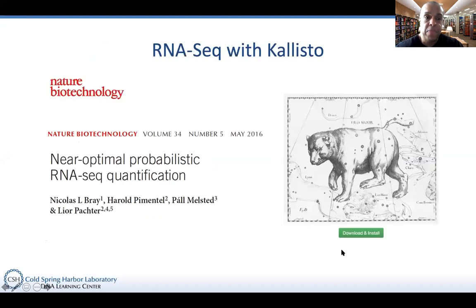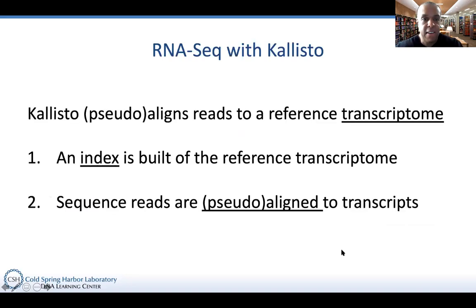software that we use. Now, in our case, what we're going to use, just like in my last series, is a software called Kallisto. This is published a few years back, but it's still really good and actively developed. And it is not only fast, which some programs can be, and they usually trade off for accuracy, but it's also really, really accurate. So we're going to go ahead and use that because fast and accurate is good. I'm not going to go in as deeply. Again, throwback, go watch the other series. But let me just give you some of the basics.